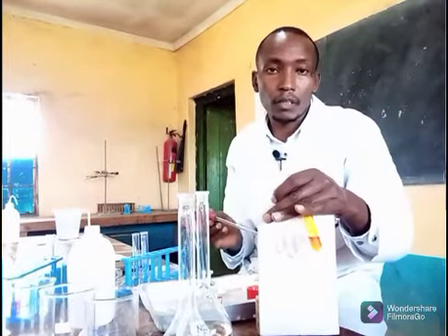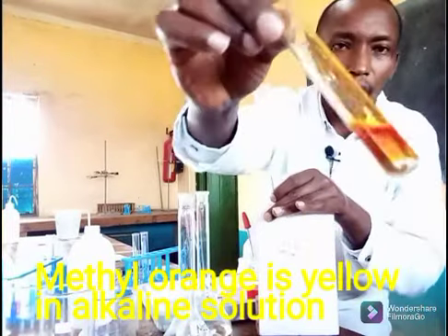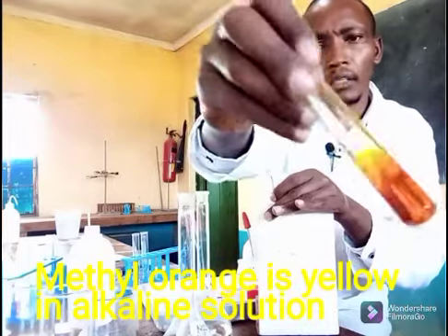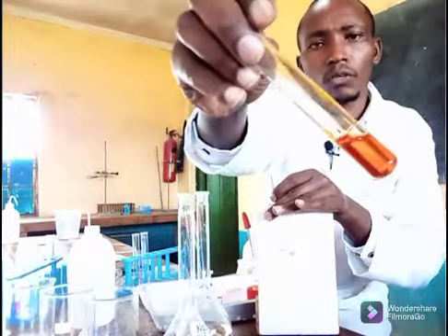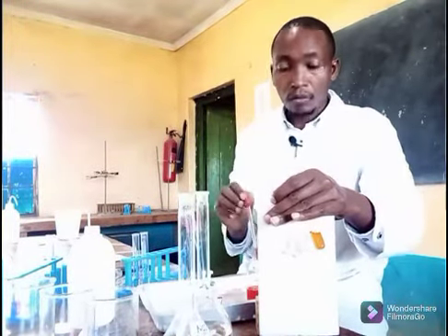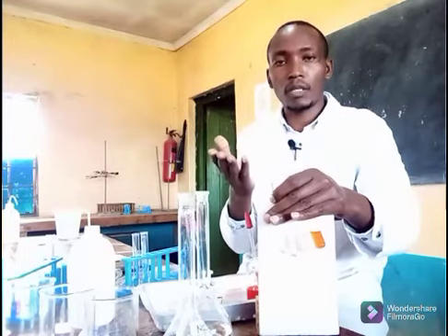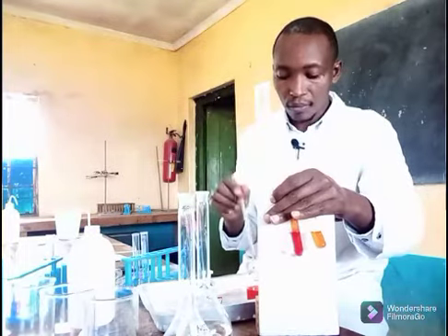So with the first one, yellow in color. That one appears more yellow in color. Yes, yellow. If you look at this part, it will tell you it is more yellow, though it's not the yellow you're expecting. It's yellow. That is, methyl orange assumes the yellow color when in a base.